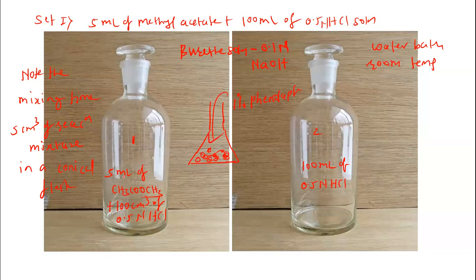Now after mixing these two bottles, from this reaction mixture we have to withdraw 5 ml into this conical flask, where we have already taken the ice and phenolphthalein indicator.